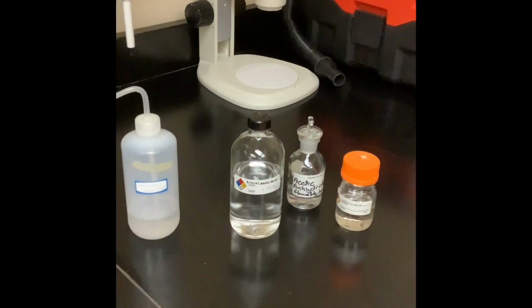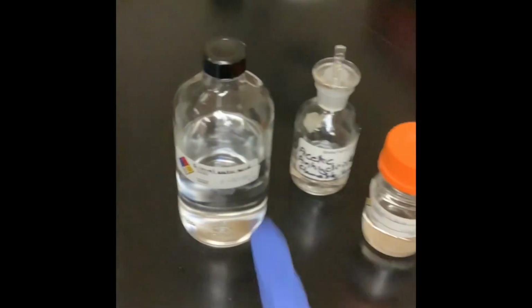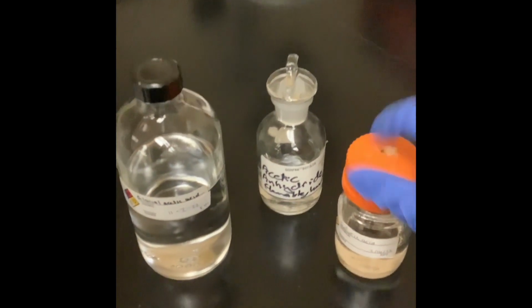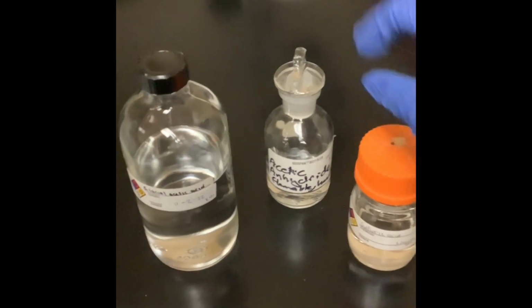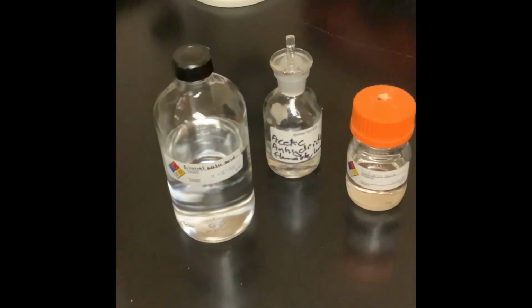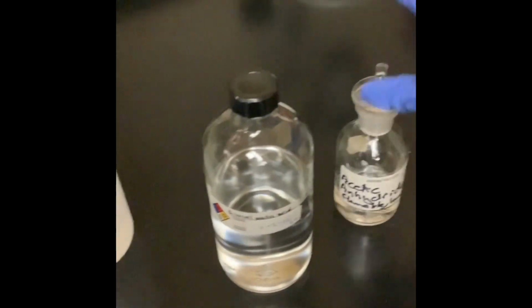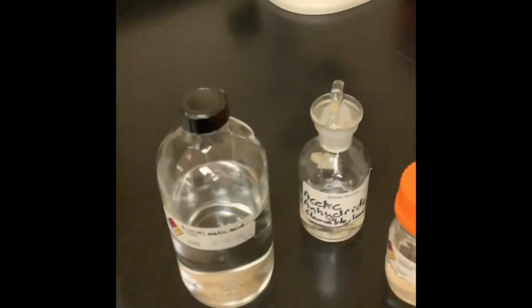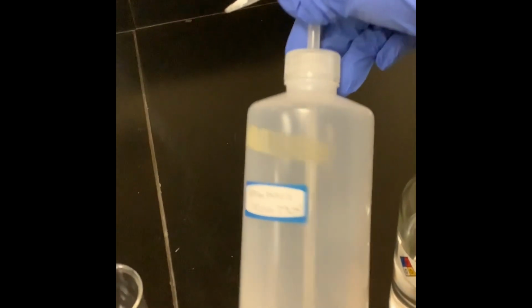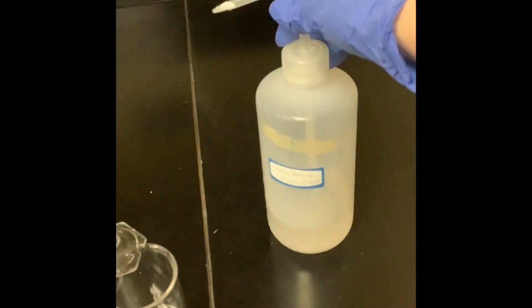This is the overview of everything you'll need to complete acetolysis. The chemicals you'll be using are glacial acetic acid, acetic anhydride, and concentrated sulfuric acid. I have all of these in smaller containers. You never want to take chemical directly from the large bottle. You always want to take little bits of it out, and as you use it, you can wash and refill these bottles. You're also going to want a supersaturated solution of sodium bicarbonate. This is going to be used to neutralize any acid that you may spill and acid that you want to dispose of.